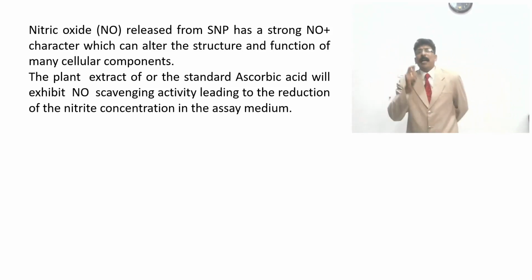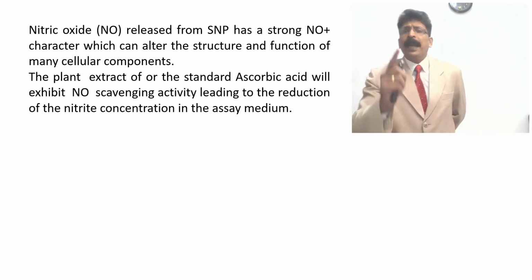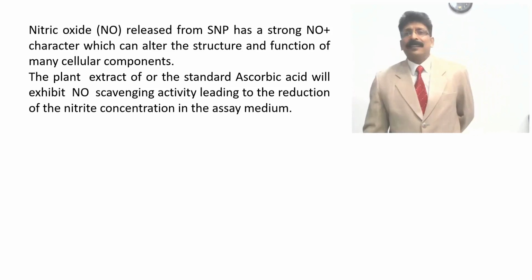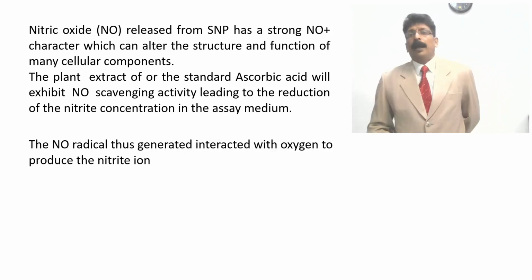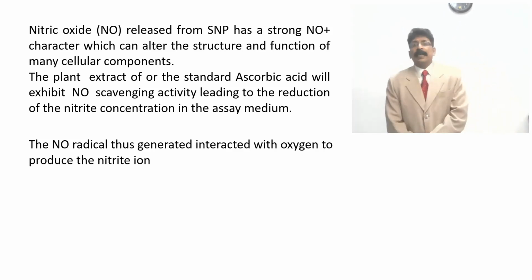We can predict the antioxidant activity. That is the main understanding. If you know this, it is a very simple experiment. Even it can be conducted in a normal lab. I expect a degree level student to do this experiment.